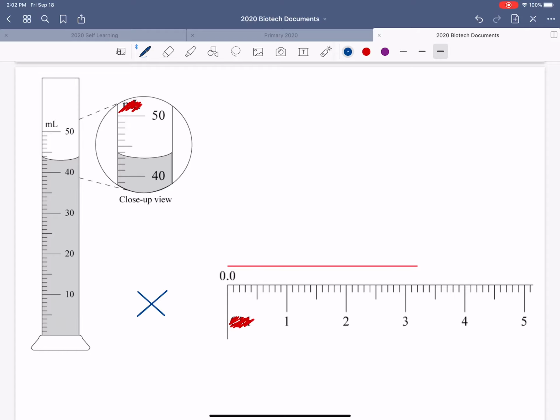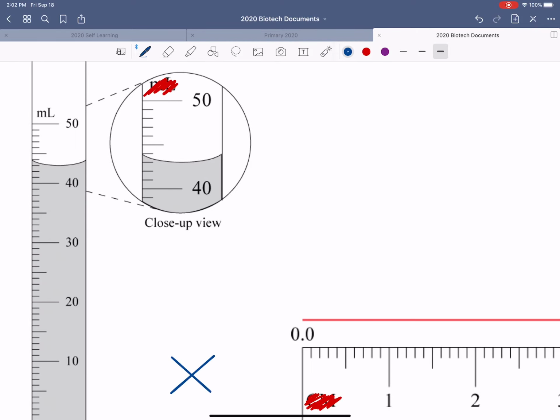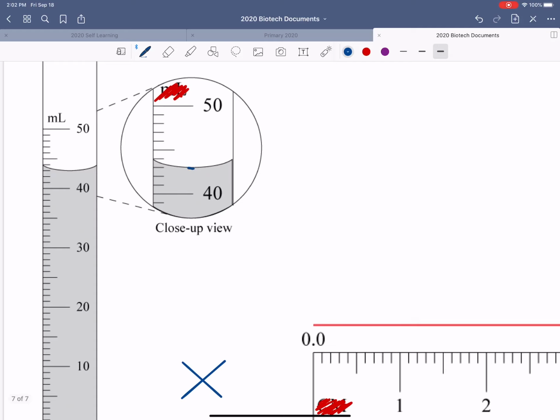Here's what we mean. Let's go ahead and first use the measurement of the graduated cylinder here on the left. If I were to look at this, I know I'm supposed to measure from the bottom of the meniscus there, the bottommost point, and I have to gauge where that goes to. So I see that it lines up really well with this tick mark right here. Knowing that this tick mark here is 40 and this one up here is 50, it looks like this counts by ones. So let's see, 40, 41, 42, 43, 44, 45. Yep, that looks like the middle of 40 and 50 here. 46, 47, 48, 49, 50. Okay, so this is 41, 42, right around 43. You're probably used to just saying, all right, that is 43.